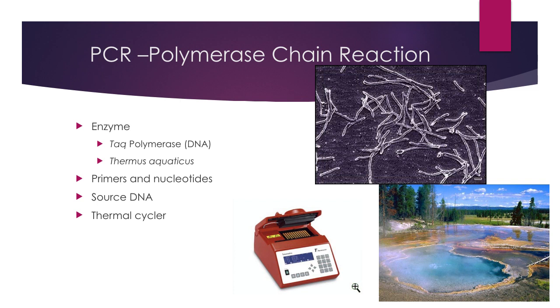This thermal cycler heats it till the strands separate, and then it cools it down, and the enzyme works to copy the separated strands. And then you run through these thermal cycles, and you can make unlimited copies. Starting from just one DNA molecule, in a couple hours, you can make trillions of DNA molecules that have the same identical sequence.